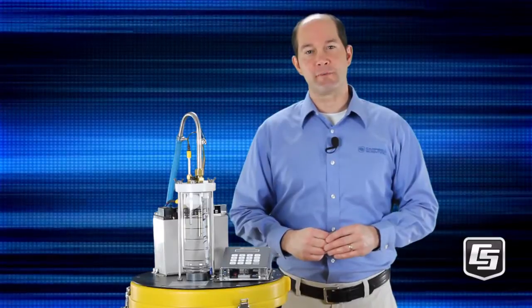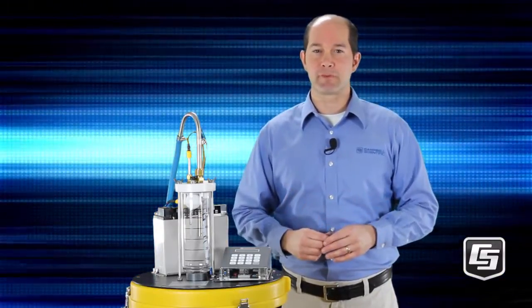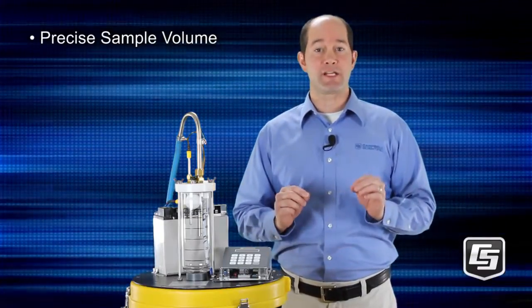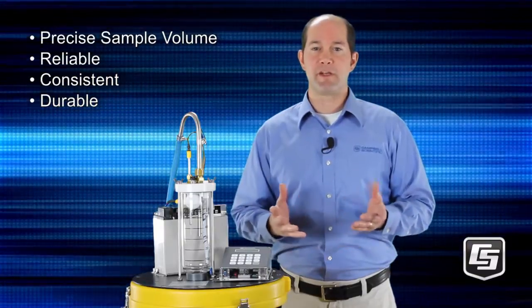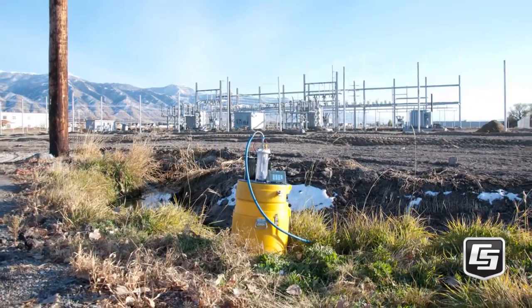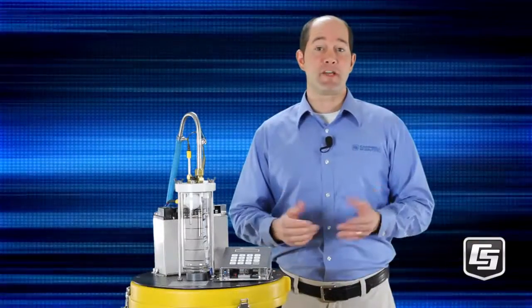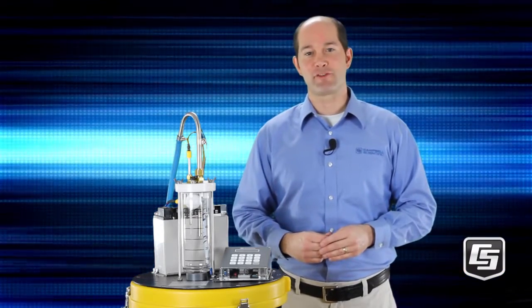The Campbell Scientific Water Sampler vacuum technology is the most reliable and consistent on the market today. Instead of wondering if your sampler has done its job, you can be assured that your Campbell Scientific sampler is functioning exactly as you want it to — taking the exact amount of water each and every sample. It is reliable, consistent, and durable. We've had customers tell us that for a decade they haven't had to replace any parts. These samplers are built to last and will do the job without a lot of maintenance time or cost. Please contact a Campbell Scientific Water Resources engineer to discuss your application and for answers about your water sampling needs.